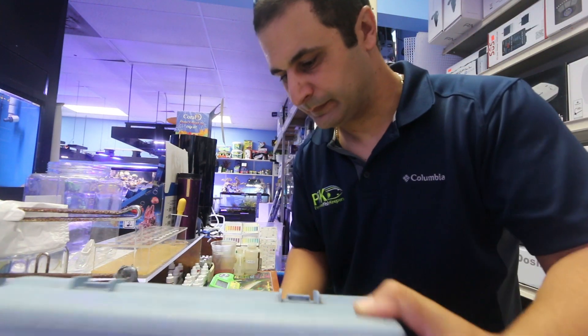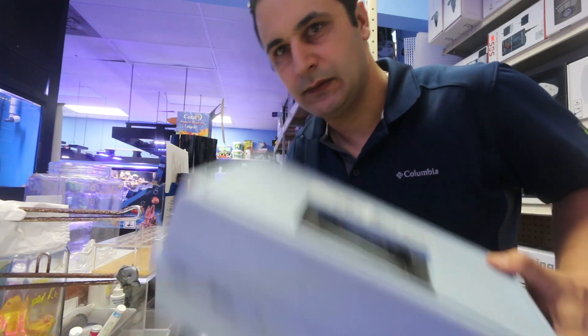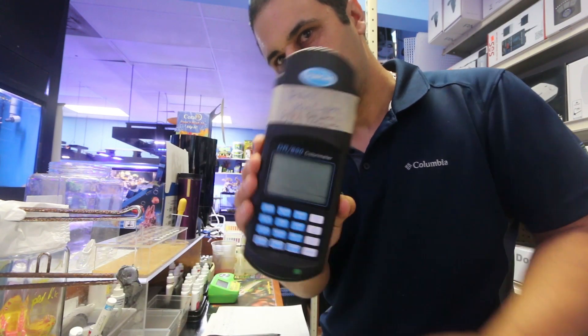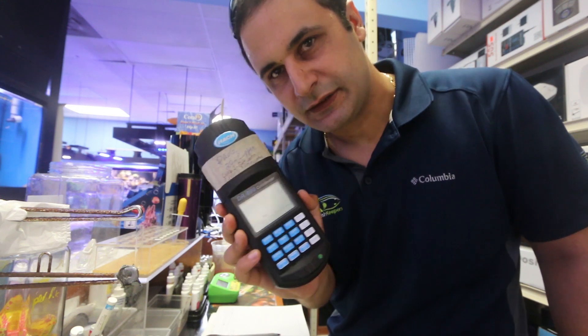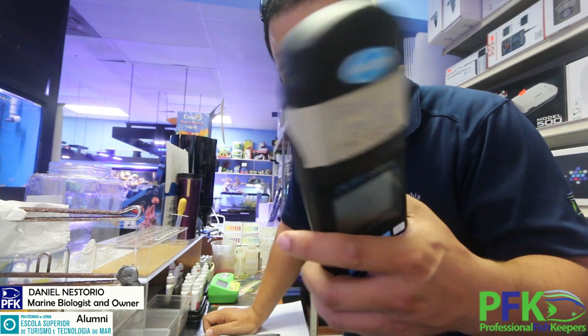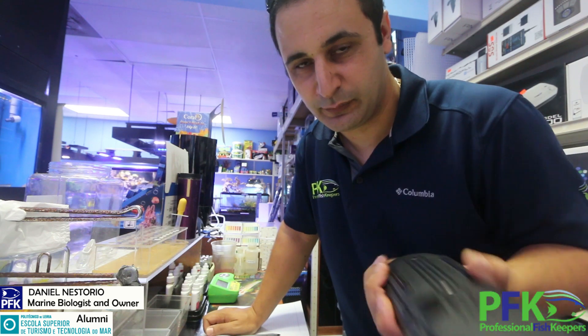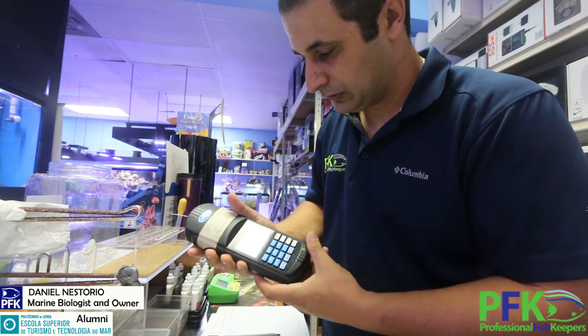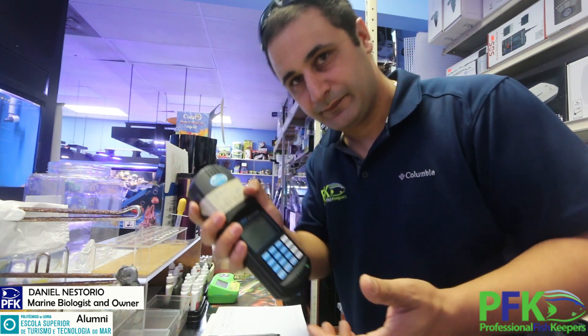This video is about how to test copper levels using a Hach system DR/890. Not everyone will have a DR/890, but this is mainly a training video for my employees so I don't have to keep repeating myself. This covers copper testing for fresh water and salt water.